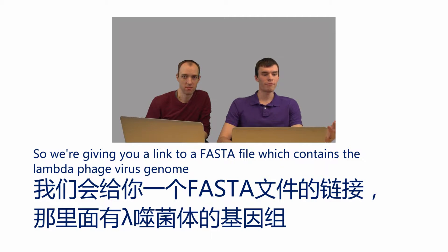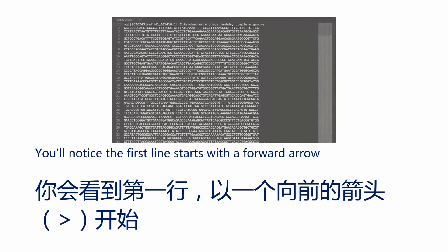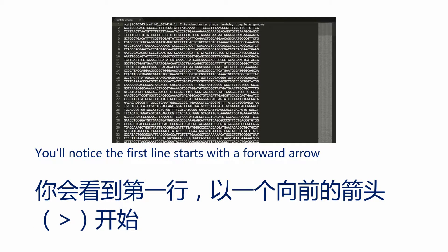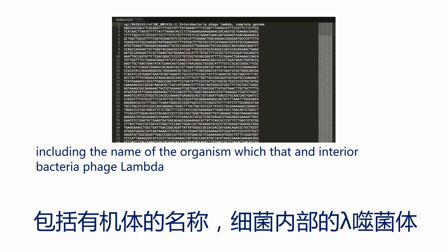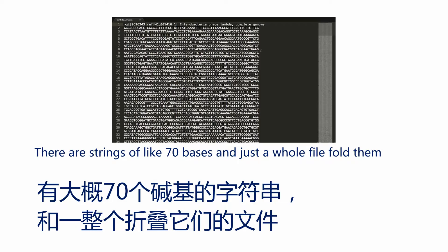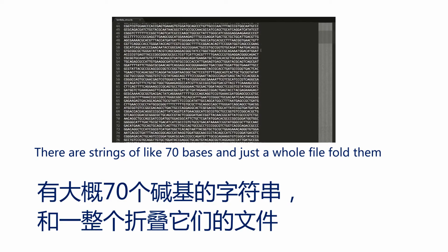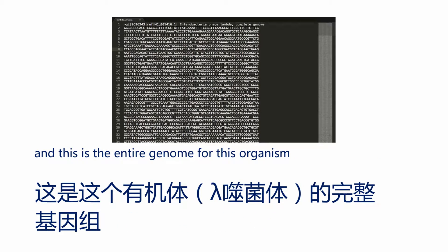We've given you a link to a FASTA file which contains the lambda phage virus genome. If you download this into your Python directory and open it up, you should see a file that looks something like this. You'll notice the first line starts with a forward arrow and then has a lot of identifying information, including the name of the organism, which is the Enterobacteria phage lambda. Following that is just a lot of bases — strings of about 70 bases — and this is the entire genome for this organism.